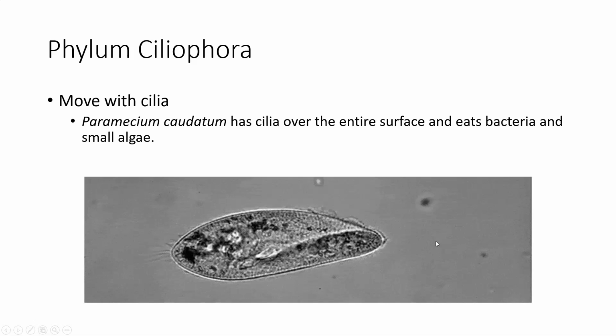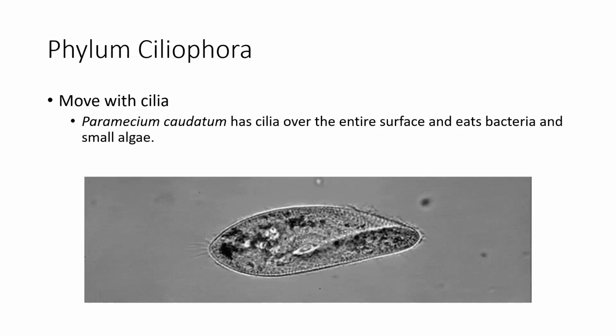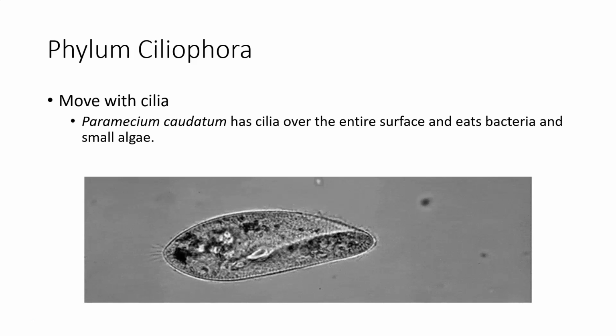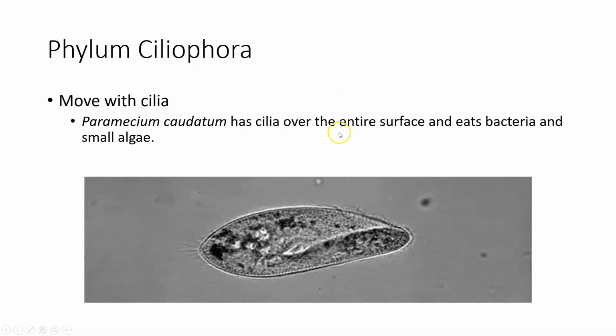I have never seen another source say that a paramecium is photosynthetic and has chlorophyll. I'm very iffy on this whole kingdom Chromista thing with the paramecium, but I'm going with what your lab manual says, and so this is what it says for the paramecium. All right.